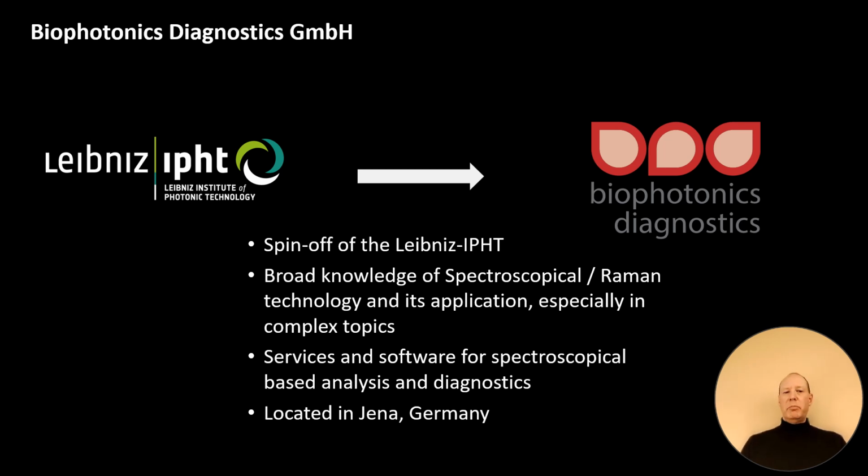The background ranges from the hardware setup to design of experiments to the data analysis at the end, especially in complex topics and with a focus on Raman technology. But we are not limited to that, because the knowledge is much broader than just this single technology.